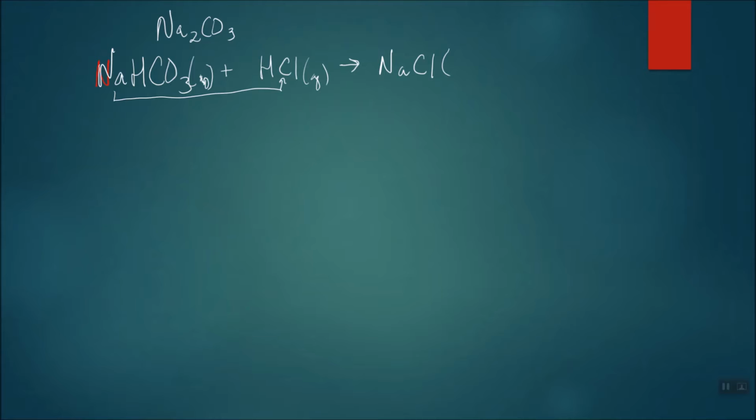Sodium bicarbonate is going to start out as a solid, and the hydrochloric acid is aqueous. And since sodium is an alkali, we know that it's going to result in an aqueous solution because all alkali metal ions are really swell. Assume their compounds are always soluble.